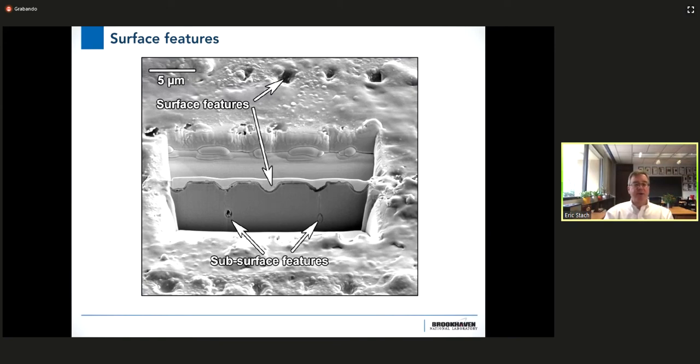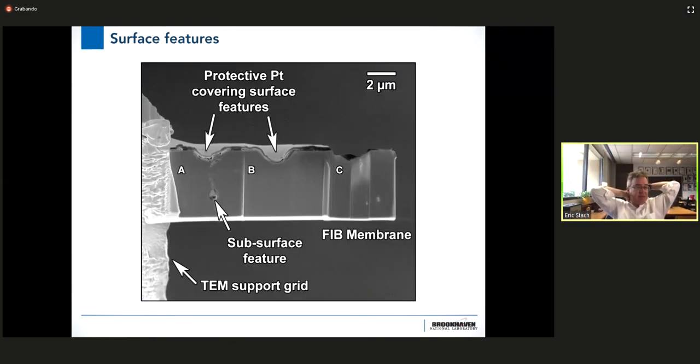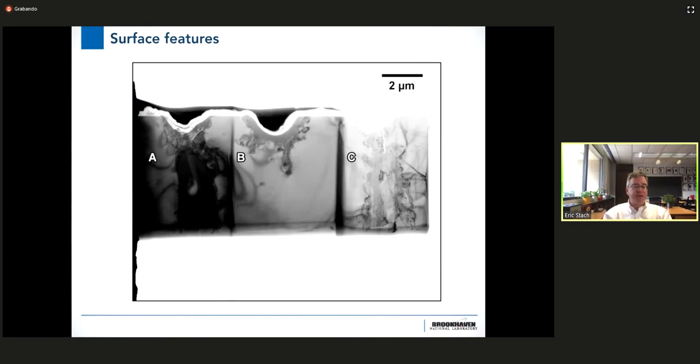That thin region can be picked up with a little mini robot. It's basically a little STM tip type thing. We pick that up with a little gripper, then we cut the sample out, pick it up and move it over onto a support grid. And there it is. This is an SEM image of that sample that has been specifically chosen in the region. And we can now take this thin sample, thin it even further, and bring it into the TEM for imaging.